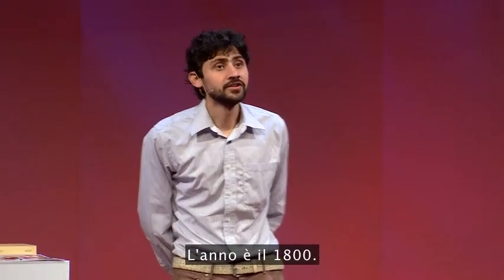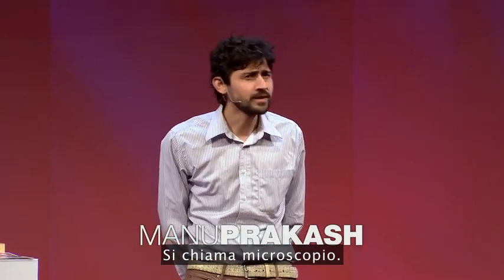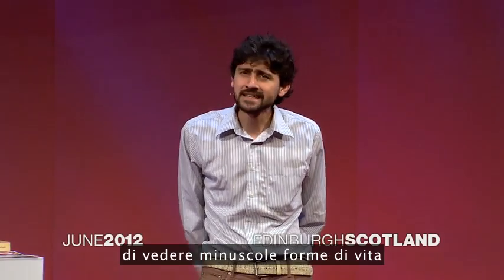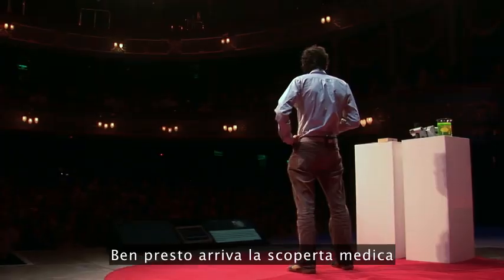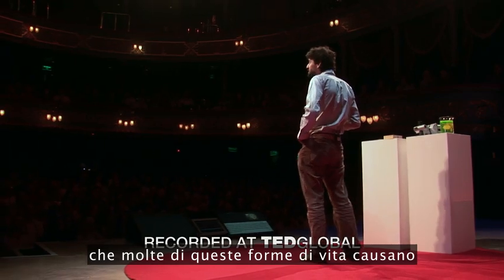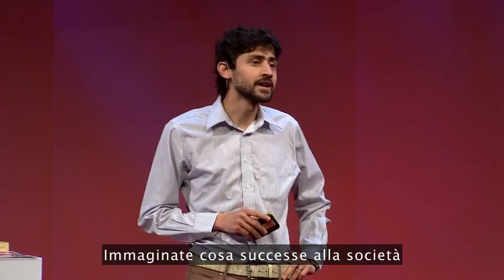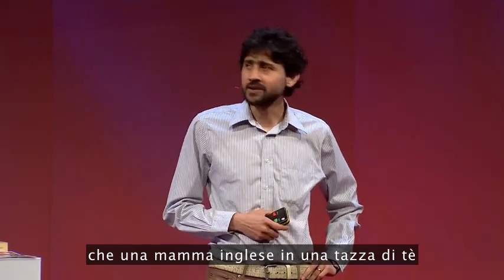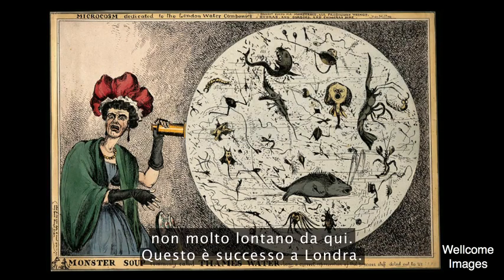The year is 1800. A curious little invention is being talked about. It's called a microscope. What it allows you to do is see tiny little life forms that are invisible to the naked eye. Soon comes a medical discovery that many of these life forms are actually causes of terrible human diseases. Imagine what happened to the society when they realized that an English mom in her teacup actually was drinking a monster soup.